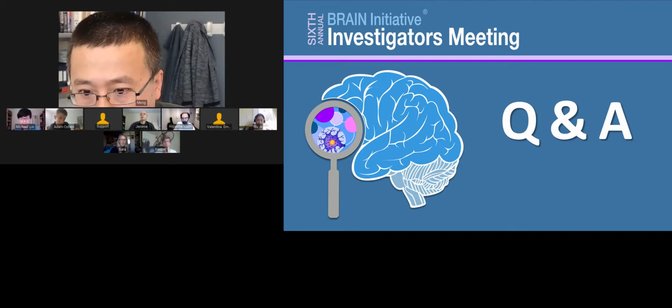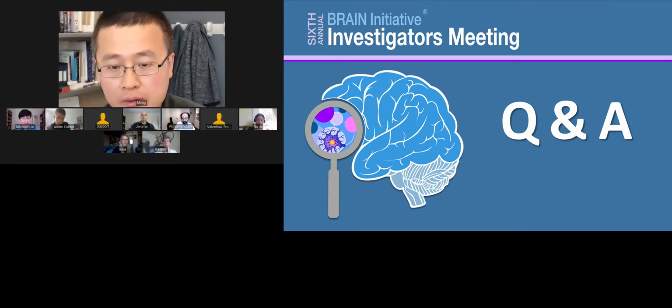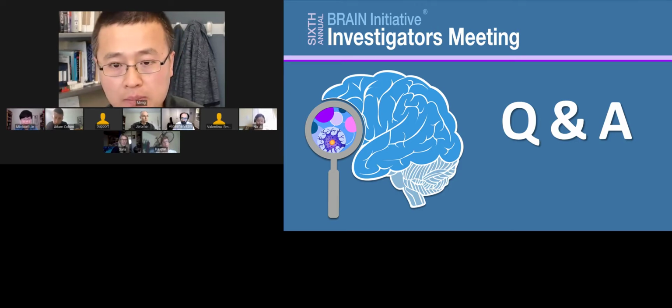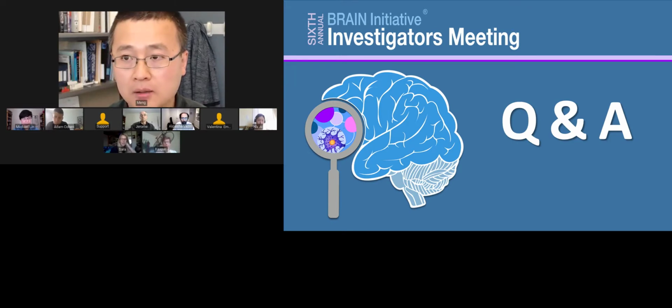Okay, so I'll start with the resolution one. The resolution is limited by the imaging probe. We tested two different imaging probes. One probe is very simple. It's just bonding a small prism to the bottom of the GRIN lens. That one has about 1.2, 1.3 micron transverse resolution, 14.8 micron axial resolution. The other probe we tested is a compound lens. That is a GRIN lens, with some miniature lenses, followed by a small prism. For that one, we can reduce the axial resolution to 10 micron, transverse resolution to 1 micron. Such resolution is okay for soma and dendrite, but if you want to really resolve synaptic structure, you need an even higher NA. We are actually working on a higher NA probe that's NA 0.7, but it's still under development.